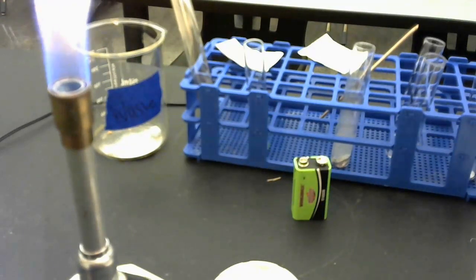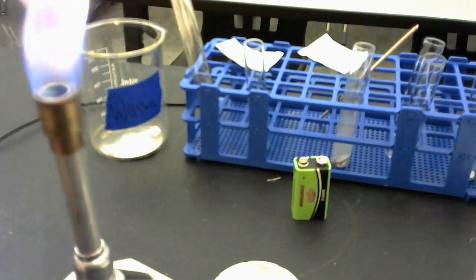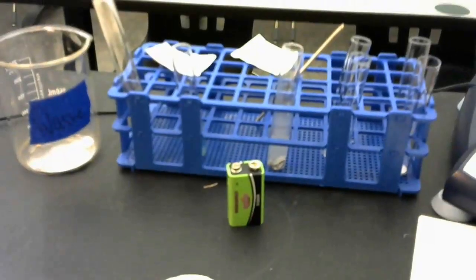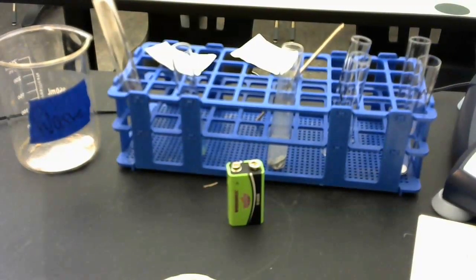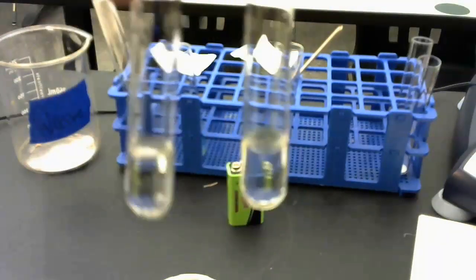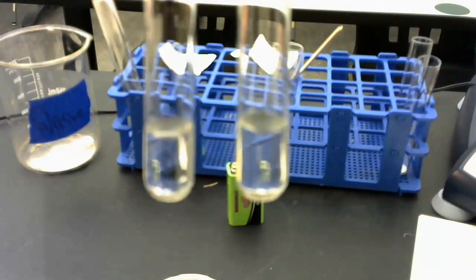Now we're going to move to reaction type D. And I'm actually going to move my flame to the side a little bit because I am going to use that coming up, okay? And my reaction type D, number 1, says add a small pipette worth of 0.1 molar AgNO3 to a test tube to a depth of about 1 centimeter and a similar amount of CaCl2. So you have two test tubes here. One is AgNO3 and one is CaCl2. Both of them are clear solutions, clear liquids.